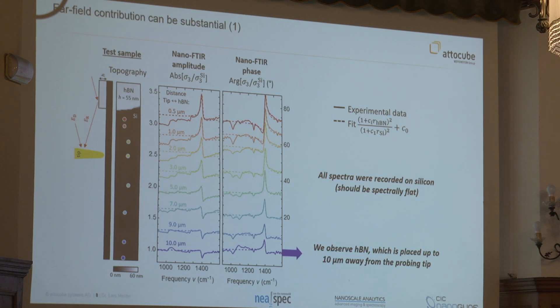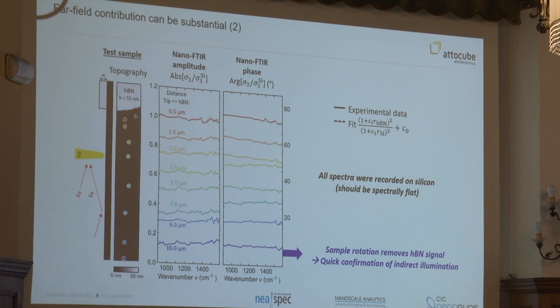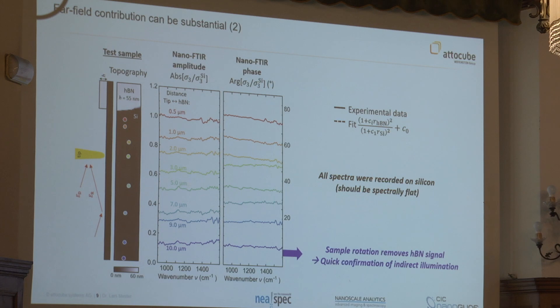It's not what you want at all. One way to avoid this problem and also show that it's an illumination effect is to just rotate the sample so that we illuminate from the other side. Now we can see that the peak that was there before is gone. This is clear because there's no HBN here. This is also a quick test for your experiments: if you think there's an illumination effect, just rotate the sample by 90 or 180 degrees. Does anything change? If yes, then probably it's a far-field effect.